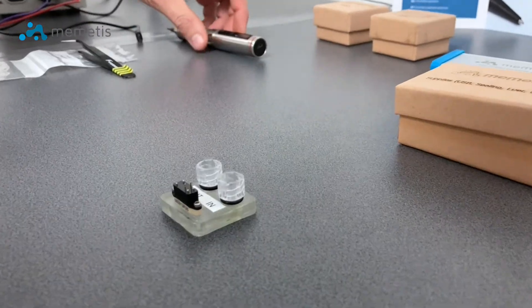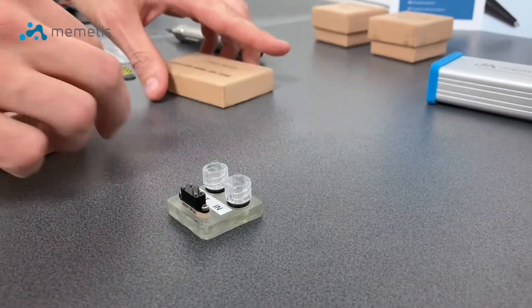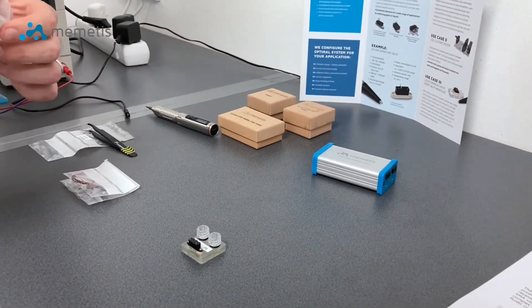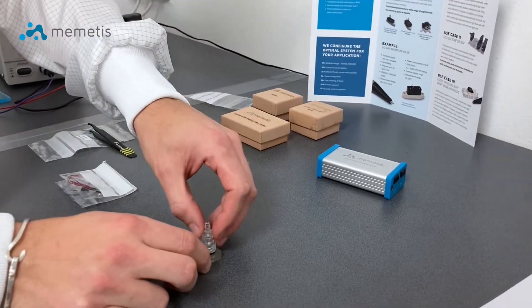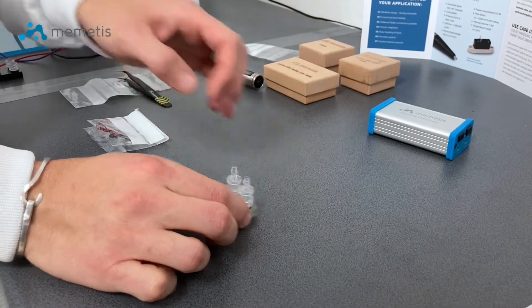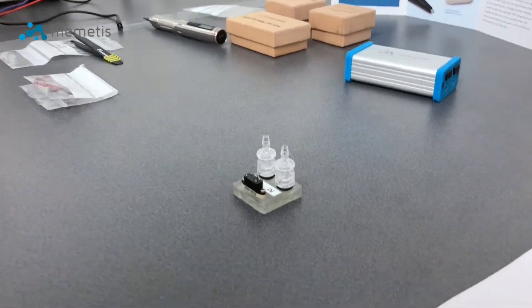Once the valve is installed, you can find suitable lure connectors in the supply package. These can be put on your tubing to allow very easy integration of the valve into your fluidic system.